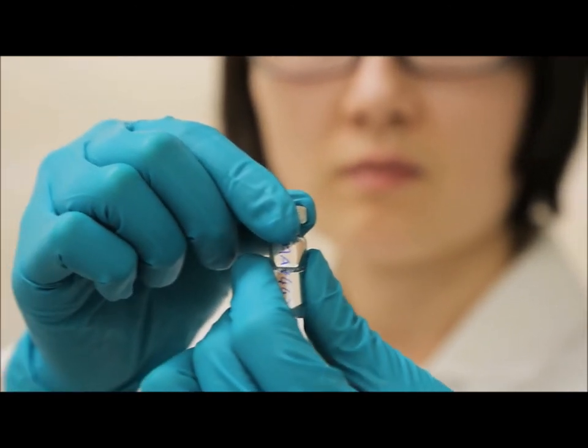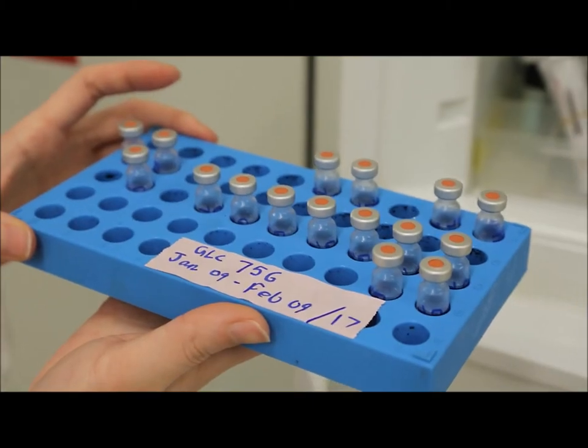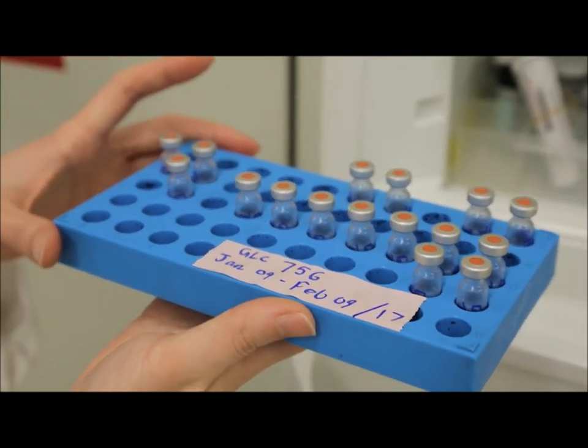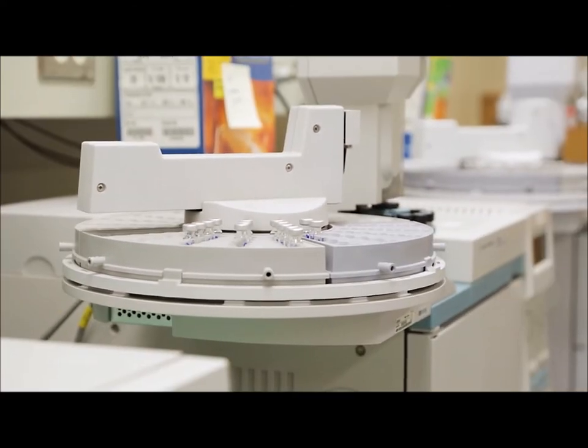We also run a check sample when we run samples. The check sample we use is GLC 756. This sample is prepared monthly and is run every time we run samples and is stored in the freezer.